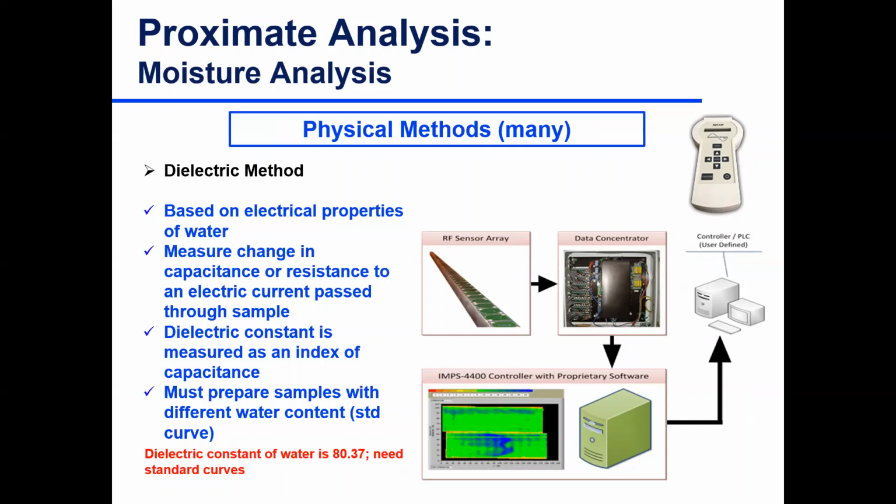Again, other approaches, there are many ways to do this. One is looking at electrical conductivity. A dry powder won't conduct much electricity, it's a poor conductor. The more moisture there is, the better conductor of electricity it is. So basically, you can monitor the ability of the food to transmit electrical current, and through this process, you can measure the amount of water in the sample.